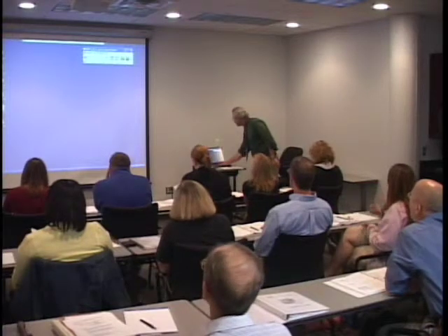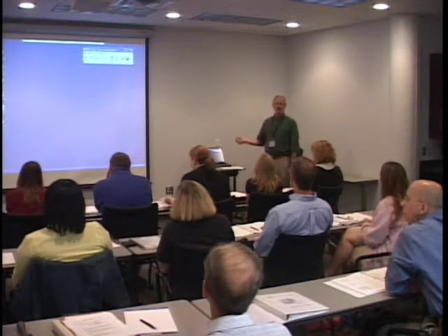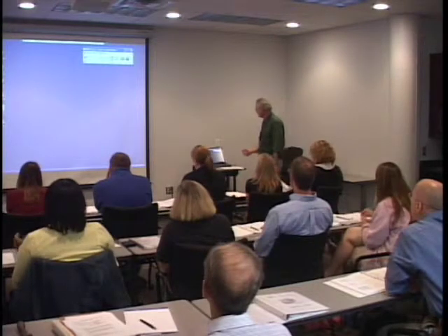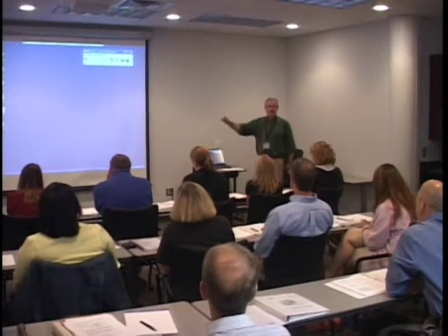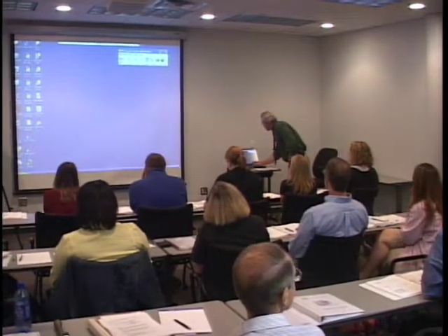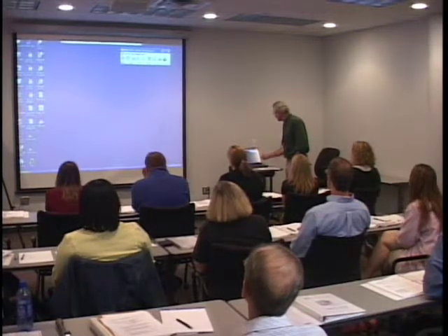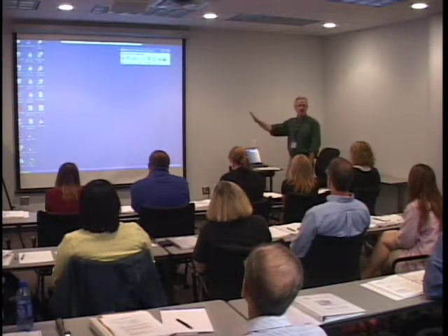We're going to turn the DART on. The gases have already been turned on, so we click the off button and you see it toggles to on. There's a little leaning man icon, which is the standby icon. Now the DART's on. We're in standby mode, so the little guy is standing by.